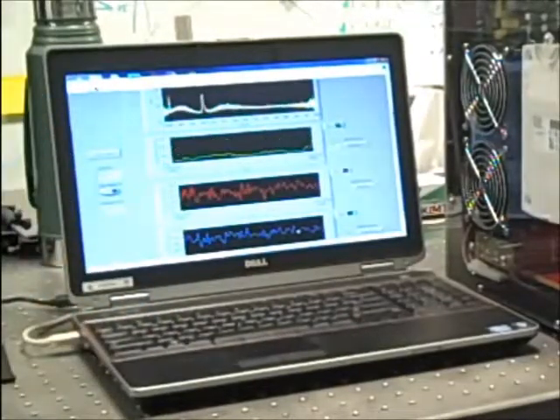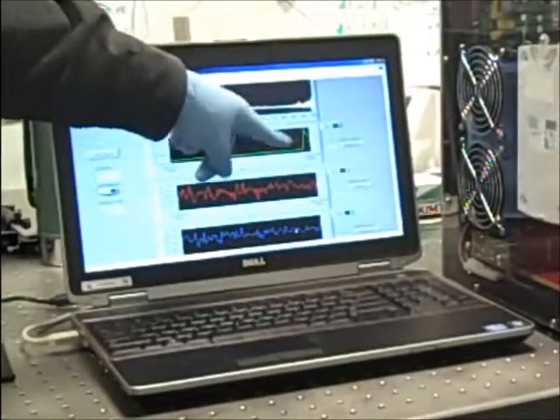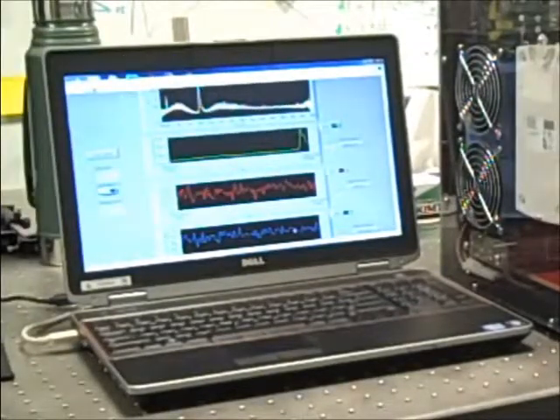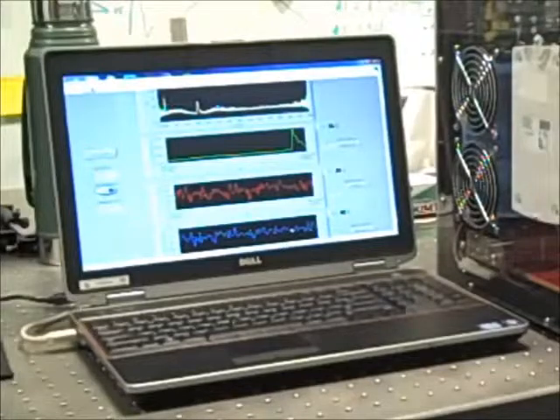The unique spectral signature of methanol enables identification, and the strength of the signal is used to measure the concentration. Note that the concentration plots are set to autoscale, and their appearance changes when a higher concentration is present.